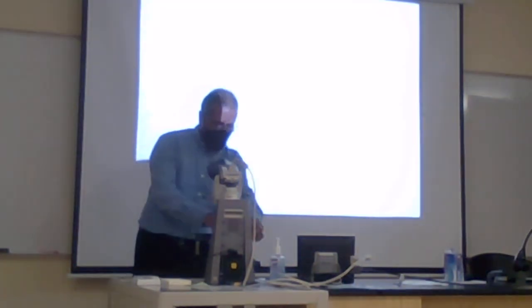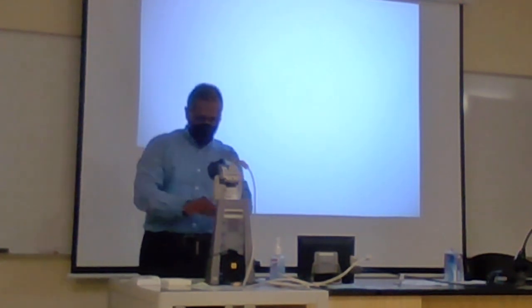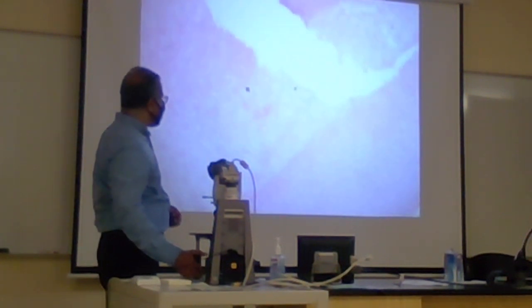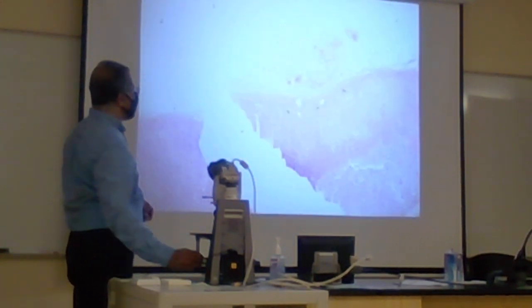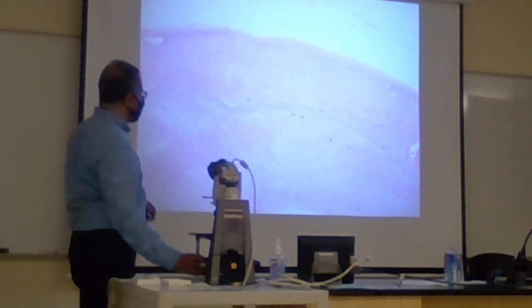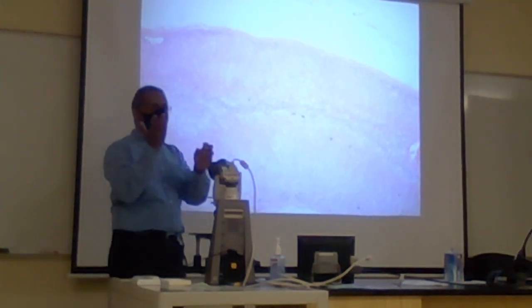So let me show you another slide of the same. The medulla is somewhat elongated, depending on the angle at which it is cut.